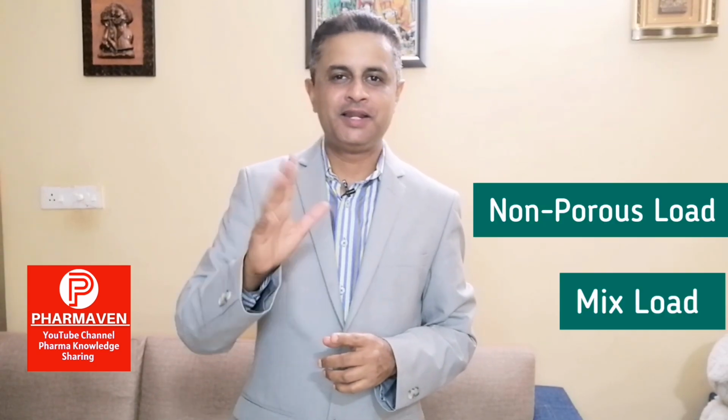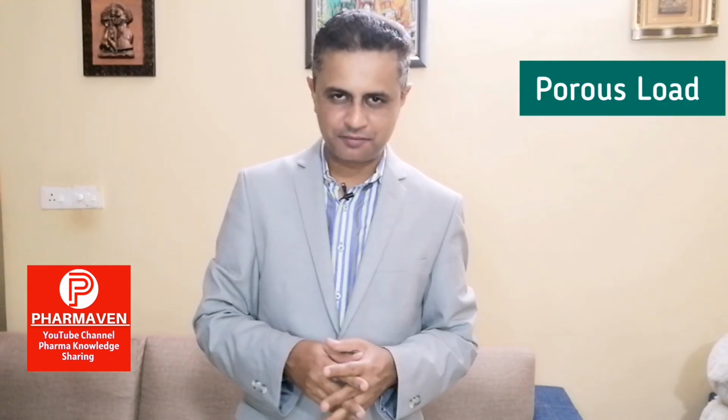In today's video, we will discuss porous load, non-porous load and mixed load in autoclave sterilization or in autoclave qualification. We have heard this terminology, we know this terminology if you are working in a sterile manufacturing environment. So what are these loads? What does it indicate? What is inside? Let's understand. We'll begin with porous load.